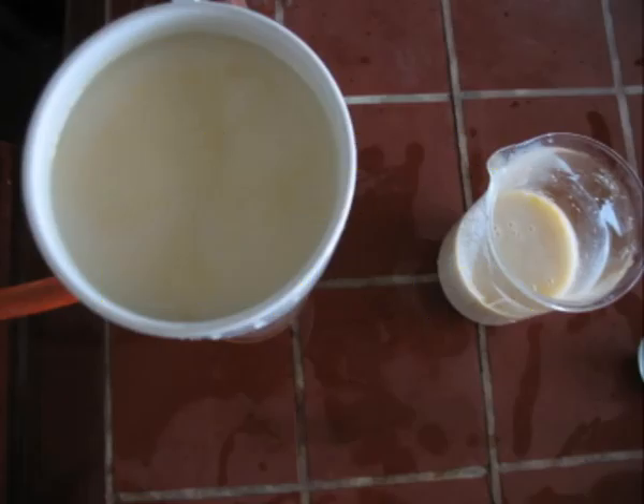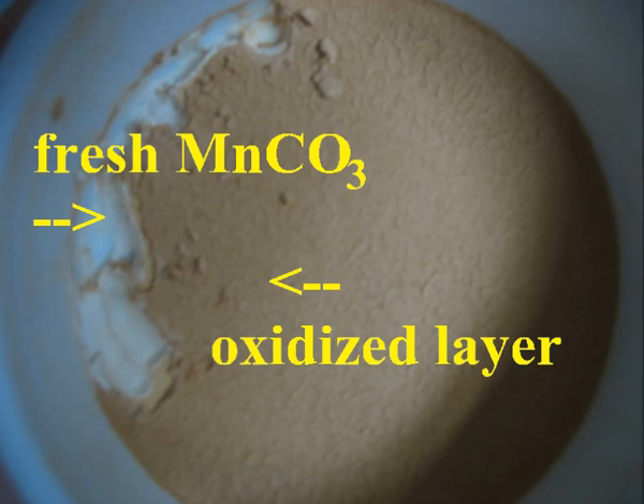This is filtered by suction, as gravity filtering will take a long time. The manganese carbonate is slowly oxidized by air, turning it to a more brownish color.